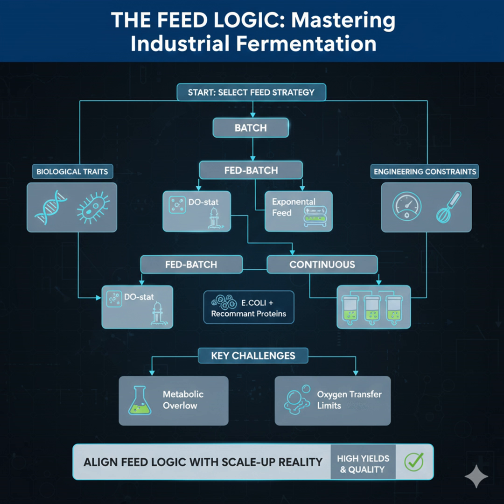Product quality. Let's start with a classic example: using E. coli to produce a therapeutic recombinant protein. If we just ignore the framework and use a high glucose batch or some overly aggressive fixed feed, the risk is acetate overflow. The toxic byproduct.